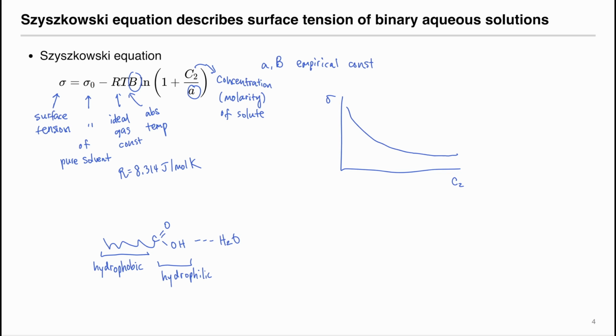If we have a drop of oil, let's say this is the nozzle, it comes off the nozzle and goes into water. Here is oil and lauric acid.